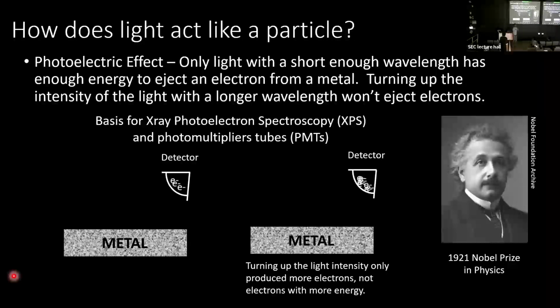Yeah, so, but turning up the light intensity only produces more electrons, not changing the wavelengths. All right.